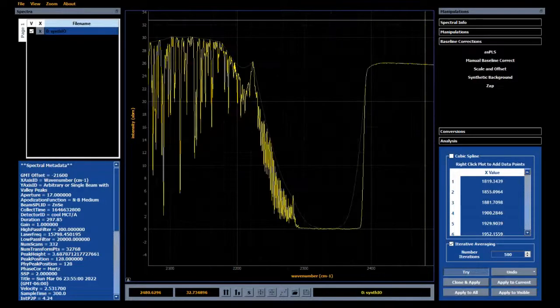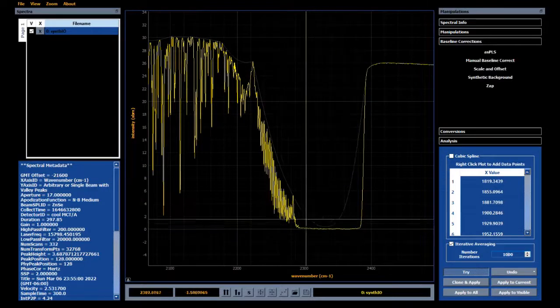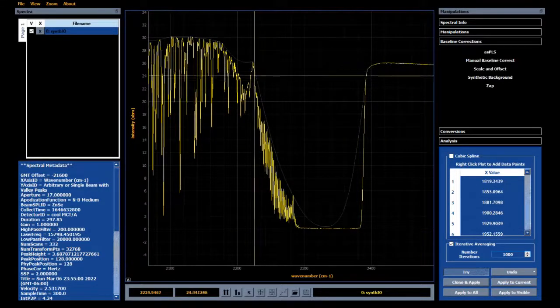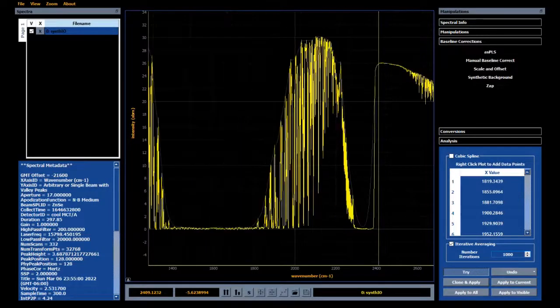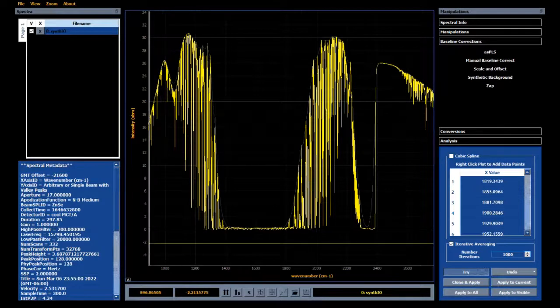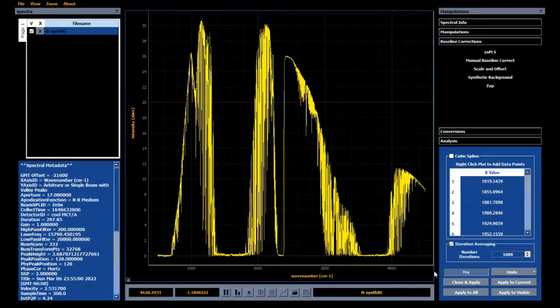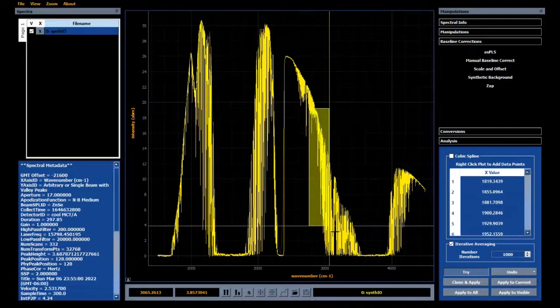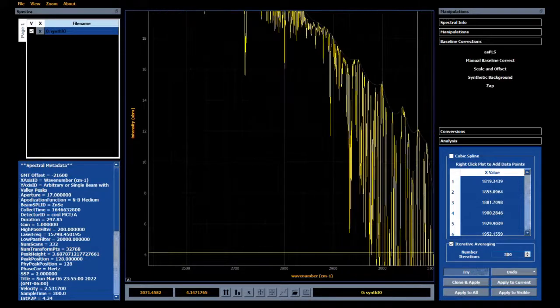To get an idea of what the iteration counter does, if I increase this value to say 1000, you'll see that the iteration count has increased so that more of the large blobby features are removed even more. So this is going to take a little bit of trial and error. If you've got a lot of heavy compounds that are very broadly absorbing, you'd probably want this number to be larger. If you're looking for more light, very narrow features, then maybe something more like 500 would suffice.